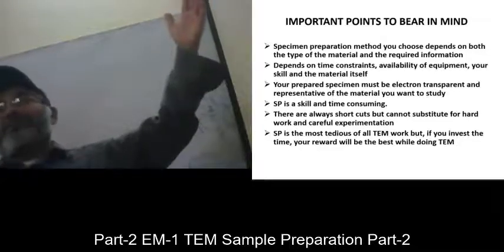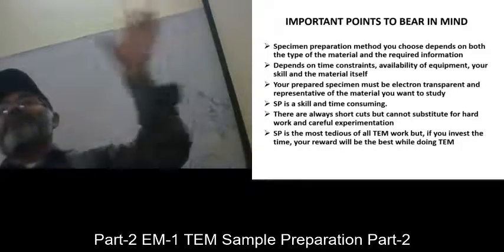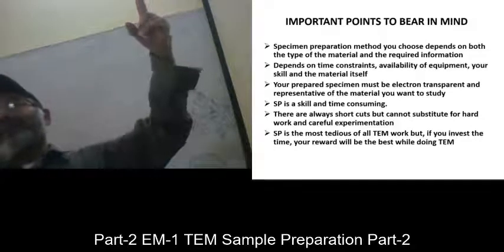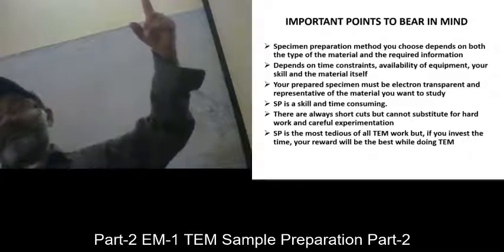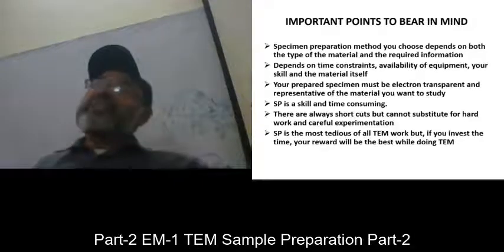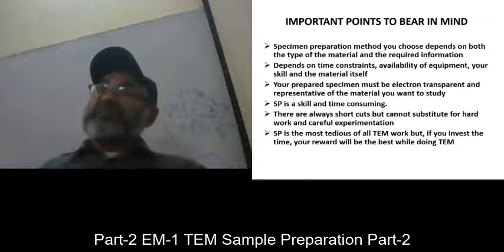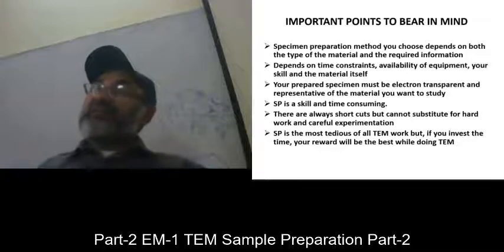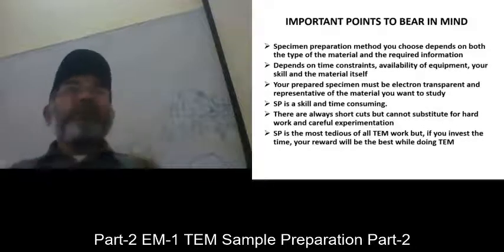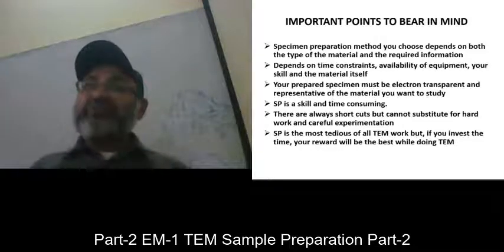When you are talking of plus minus 5, then you have a free space of 10 degrees or 10%, right? So it depends upon the resolution as well as the statistics of your result, on how correct the information is. So the more information you collect, the more accuracy you will achieve.